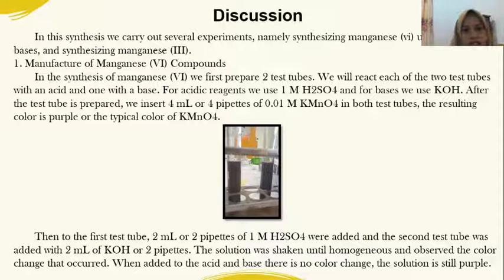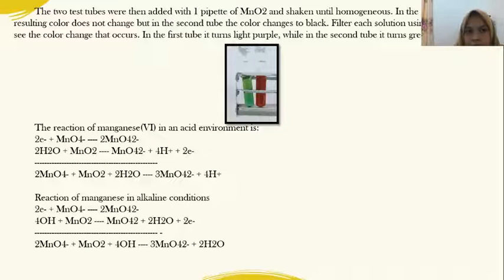Then, the first test tube: 2 milliliters or pipette of 1 molar H2SO4 were added, and the second test tube was added with 2 milliliters of 2 molar KOH. To the test tubes, we then added one pipette of MnO2 and shook it until homogeneous.